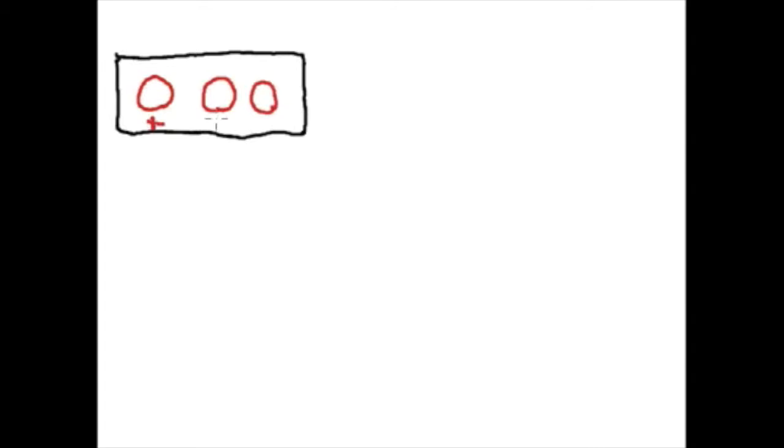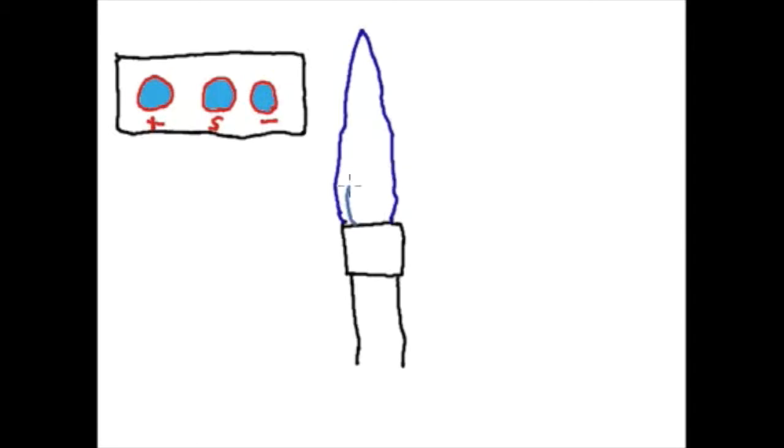To determine the validity of the staining procedure, a putative positive and negative control are smeared on the same slide as our sample of interest. In this example, the S stands for our sample of interest.